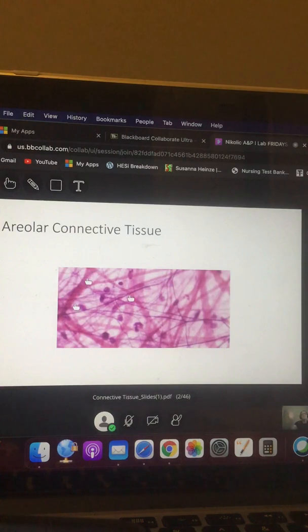That's it. If you like the thing, great. If you don't, give me some markers. Yeah, there we go. Collagen fiber. Now, be careful. It's the thick part. Yep, it looks like a ribbon. It could be dark pink. It could be dark purple. Ribbon. Thick. Makes sense, right? Collagen is the thickest fiber.